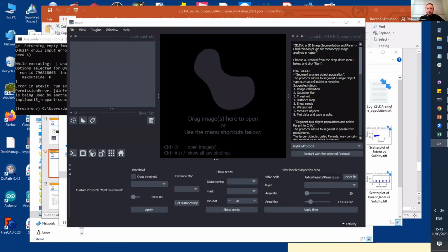I will look at the last question that was here. Can you have a plot that is a mean of all? Can you activate the microphone and just specify what is the meaning of this? I mean, of yes. Because you showed a plot of each cell. Can I have a plot of everything together, a mean of the results?